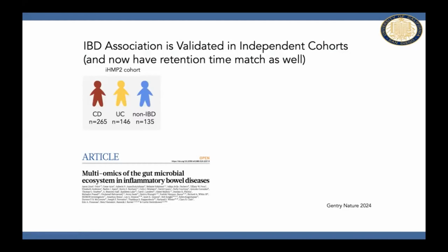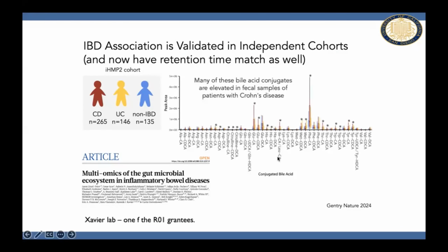And so we had synthesized all these bile acids. We sent those synthesized bile acids to the Ramnik Xavier lab, who also is one of the R01 grantees that is part of this knowledge base that's being created. And they had an IBD cohort, and they did retention time matching. And the strength of that is that you no longer have to call it a trihydroxylated bile acid, but we can actually call it a cholic acid or deoxycholic acid or chenodeoxycholic acid. They found 62 of the ones that we sent them. And all the ones with stars are associated with Crohn's disease in relationship to non-IBD controls.